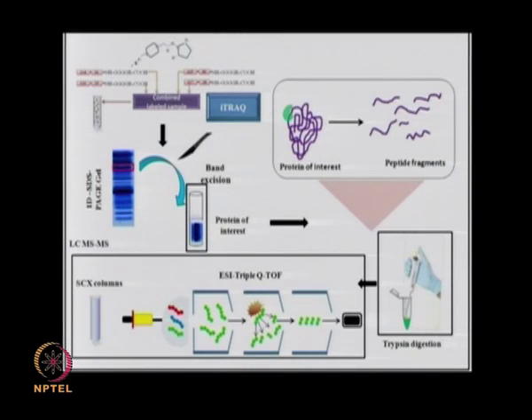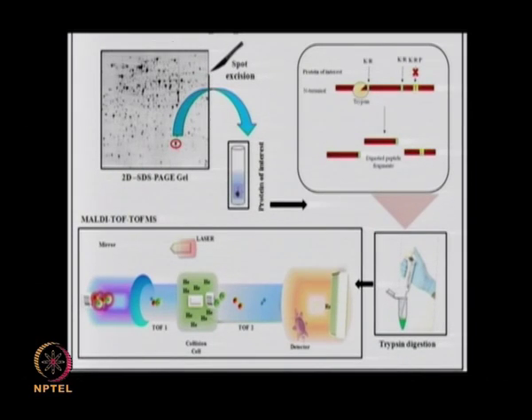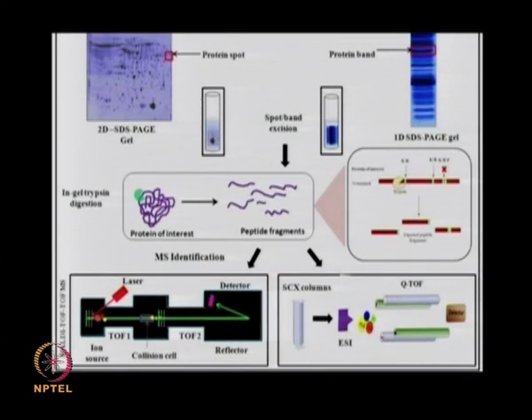The gel based techniques increase the dynamic range of analysis since they involve sequential separation of proteins based on the molecular weight, lower to higher molecular weight. The mass spectrometric identification of the target protein greatly depends on the efficacy of the in-gel digestion process that generates a mixture of peptides from the target protein through proteolytic digestion.